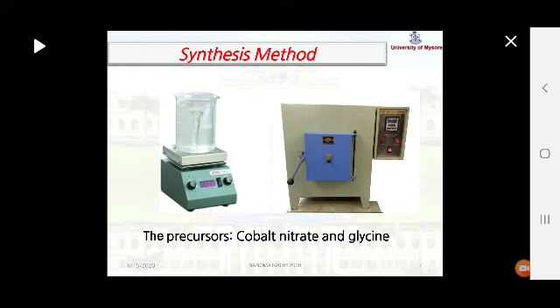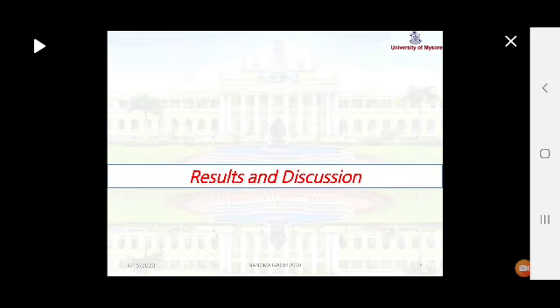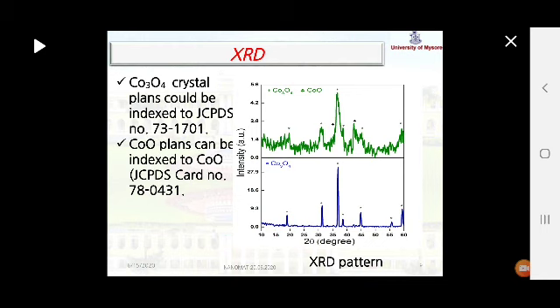These have been optimized by varying the nitrate and fuel concentration and also the calcination time duration. Moreover, here we see the characterization of the sample. We use the XRD result for the pristine nanoparticle and the nanocomposite. The pristine nanoparticle showed high crystallinity, and on the other side, the nanocomposite shows broadened peaks, indicating the composite formation and low crystallinity in the sample.